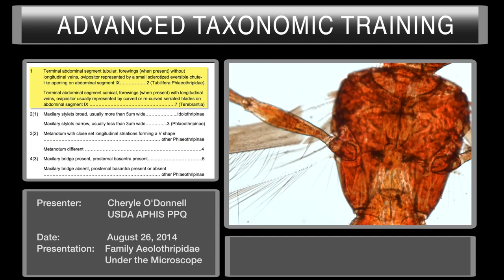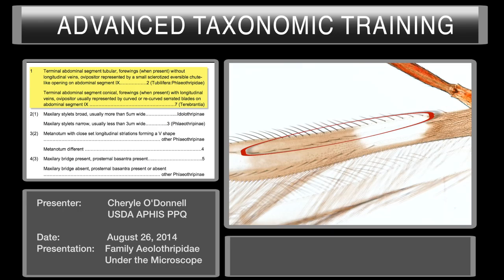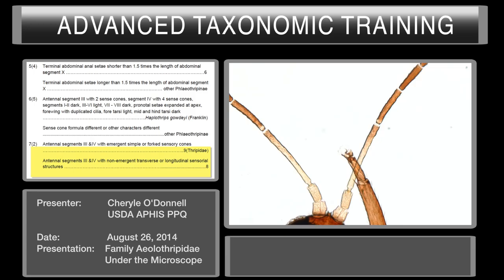As you can see, this fits within the Terebrantia. It is cone-shaped and it has this saw-like ovipositor, so that's the second part of couplet number one. If you move your specimen down to find the wings, you will find that the wings have two veins and they have microtrichia setae on the wing itself. Both wing veins have setae on them and there is a bridge between the two veins — it's a little difficult to see on the specimen. This will take us to couplet number seven in this key.